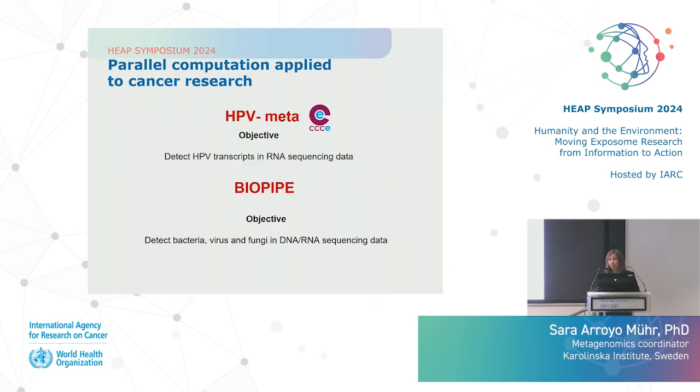We presented the HPV meta in our previous Bring Your Own data, because we belong to the Center for Cervical Cancer Elimination, and cervical cancer is caused by HPV. So of course we had to have a pipeline to detect HPV transcripts. But now we are presenting here Biopipe. Biopipe is a pipeline to detect bacteria, all viruses and fungi that are present in DNA or RNA sequencing data.